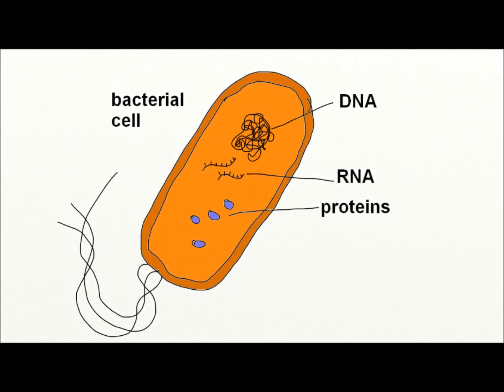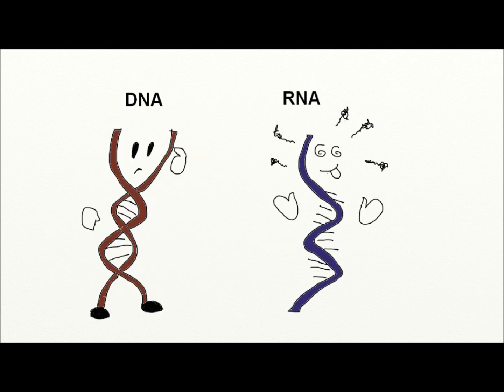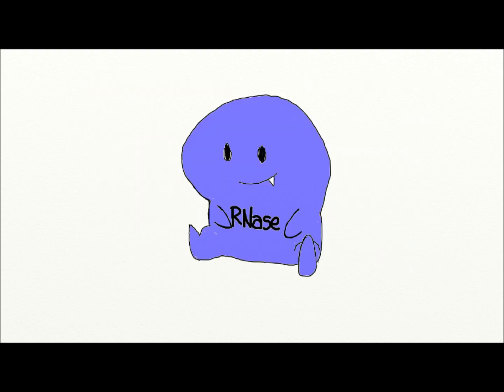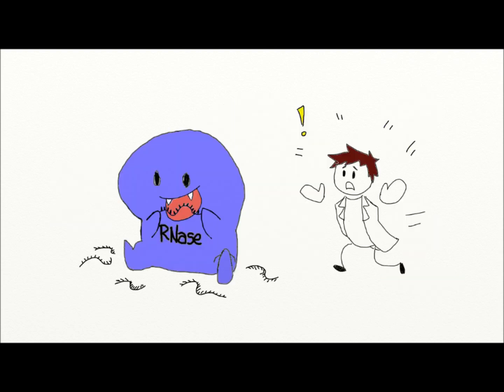RNA extraction is the purification of RNA from biological samples. Unlike DNA, RNA is more unstable due to the presence of a hydroxyl group at the 2' position of the pentose ring. To further complicate matters, the ubiquitous presence of ribonucleases in cells, tissues, and environment can rapidly degrade RNA, thereby complicating the RNA extraction process.